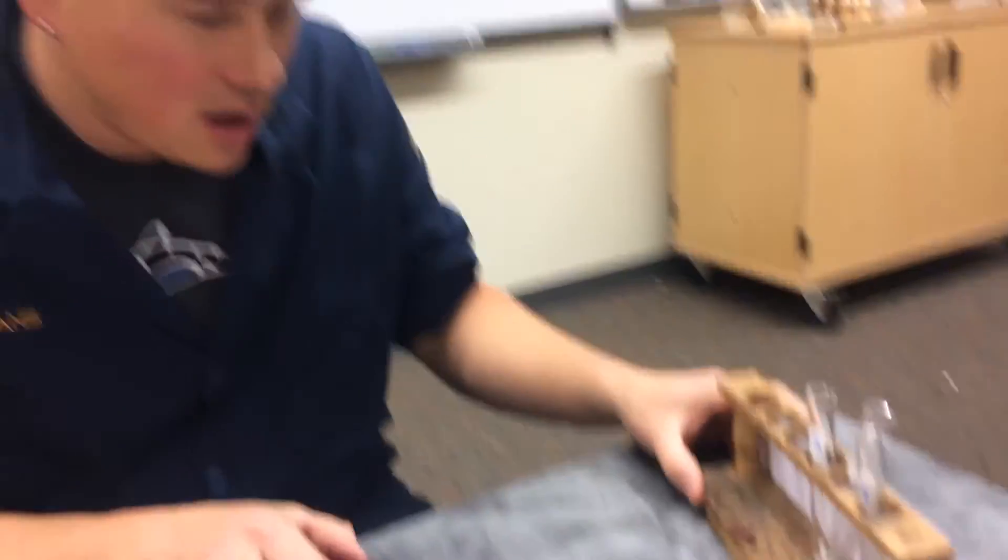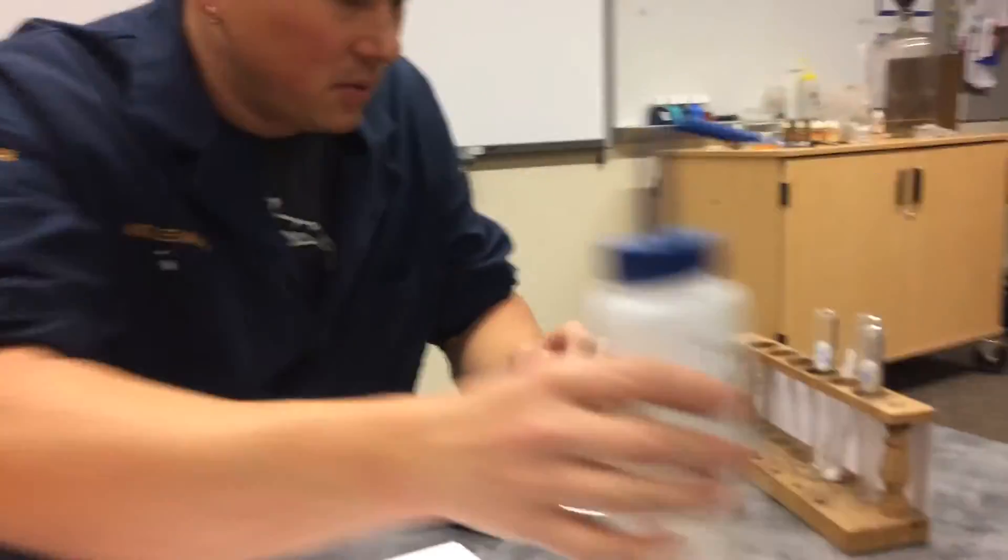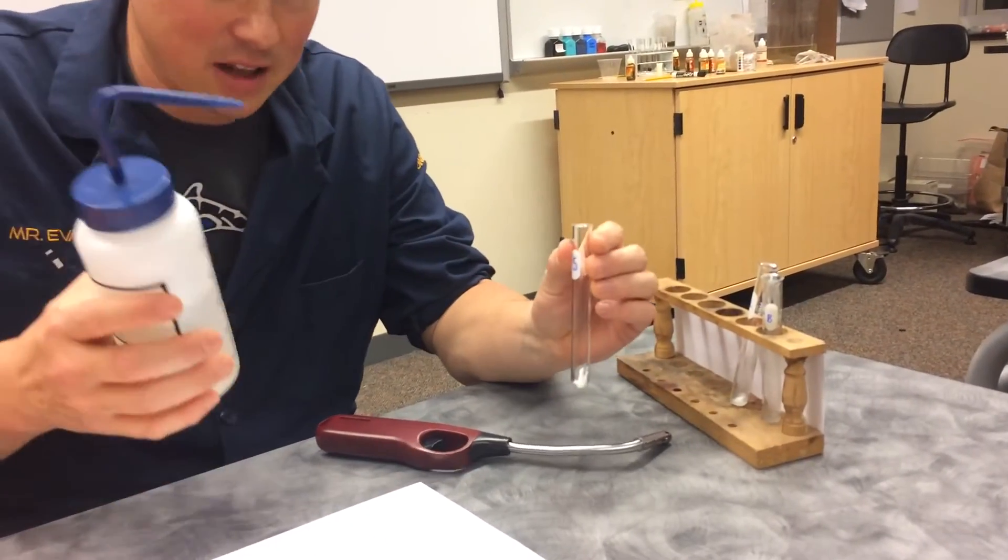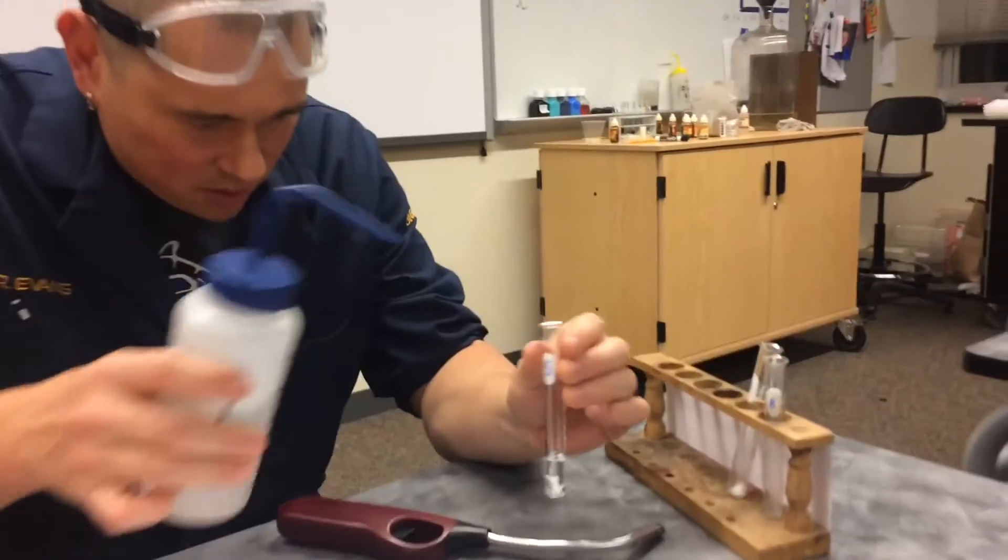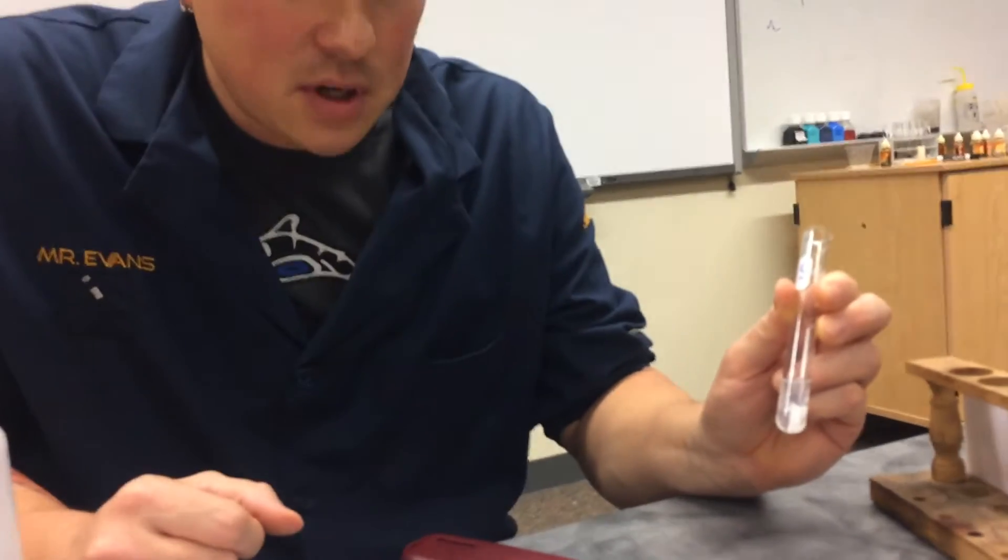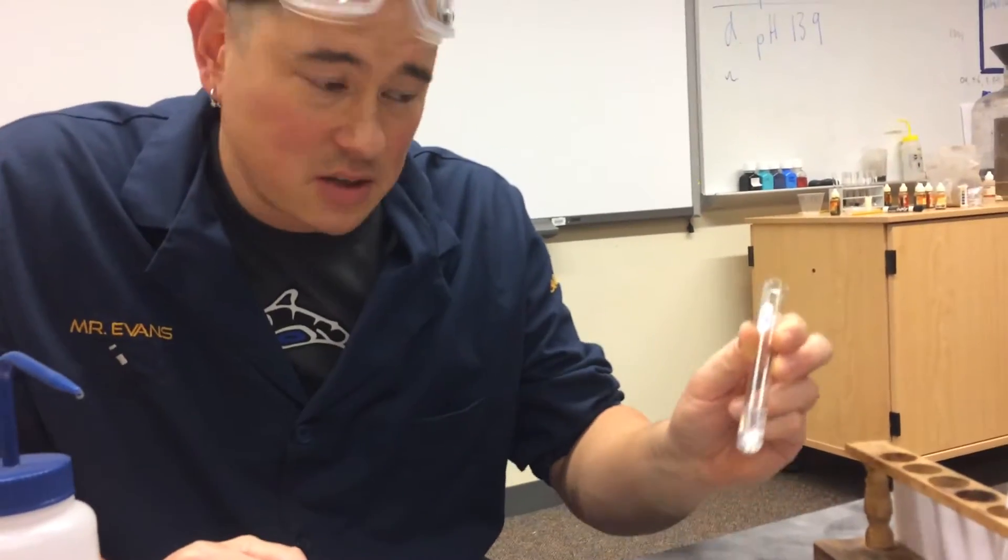All right. So basically what I'm going to do is I set these up so that I've got my soap in here. I'm going to add a little bit of water, but I just wanted to make sure you saw it with soap. So we're going to add a little water just because we know that when we test with universal indicator, it needs to be a liquid.